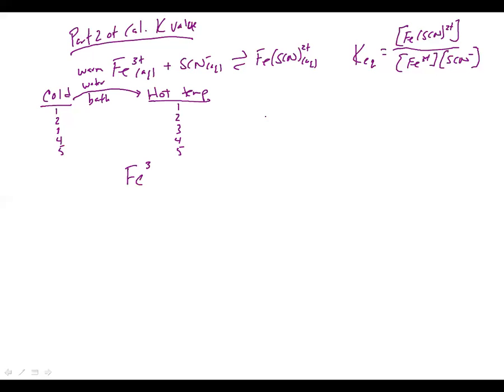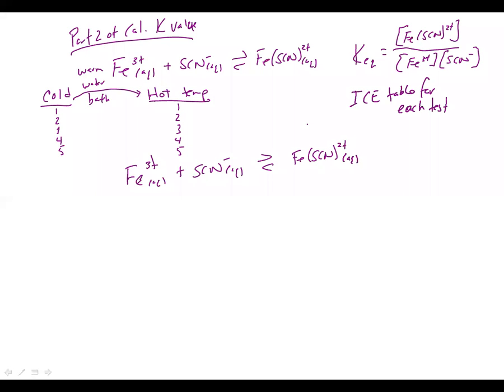like we talked about in lecture. For each individual test tube, you actually will have to do an ice table. We'll talk about a way you could do it a little quicker perhaps than by hand, but we'll talk about how you need to do the calculation by hand.